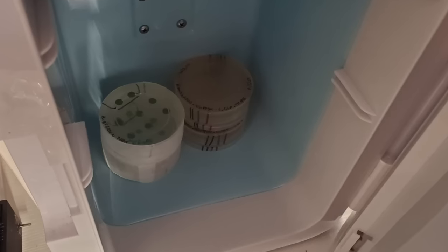So whenever I want to do an injection, I make 2 tubes. One that I'm going to inject, and another one is backup in case the injection doesn't work. And so if I'm really confident, I do both at the same time. But essentially, what I would do is I would grow up Agrobacterium, make it virulent, and then expose it to those leaf discs for about 20 minutes, and then put it on media in the dark such that the bacteria and the leaves co-culture on your plant media for 72 hours.